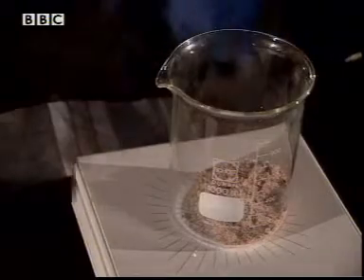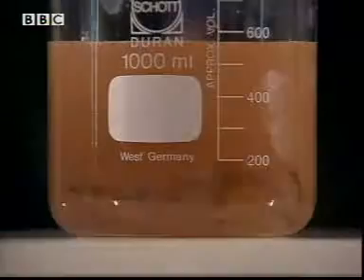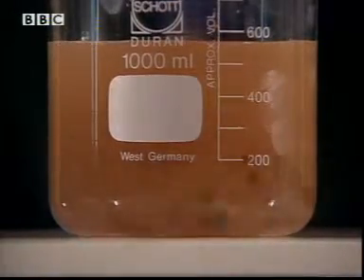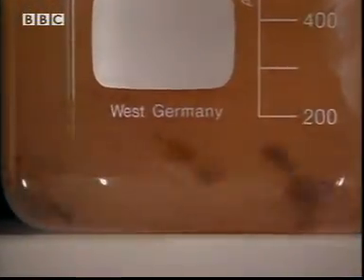Take 100 grams of fresh crushed rock salt. Add water and mix well for two and a half hours. The salt dissolves, but of course the clay does not.